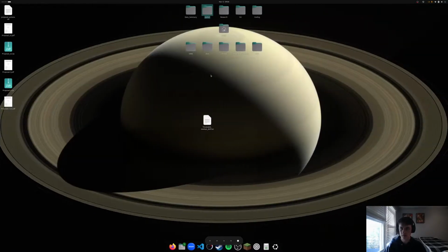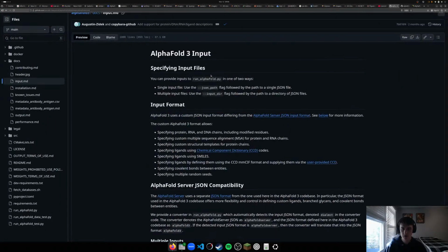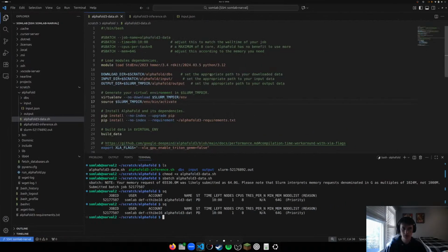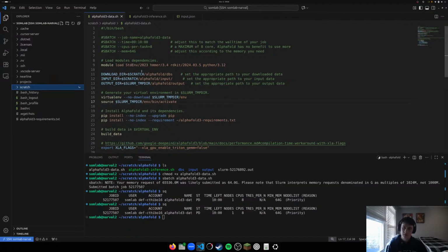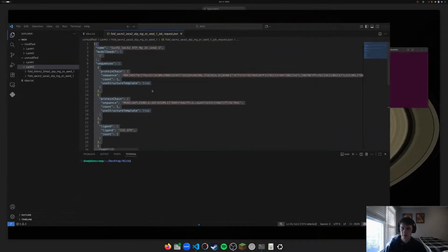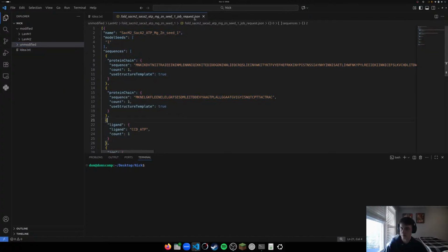In the meantime, one thing that we can do is set up a simulation for a homolog of the protein that I'm studying. So specifically, I want to do something, I forgot.